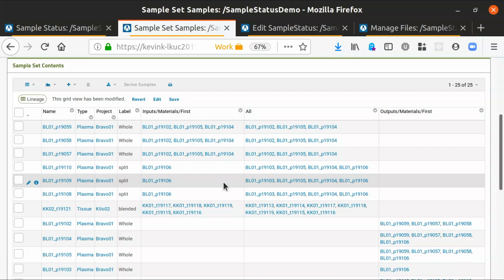So how does the sample manager interact with samples that are uploaded? Not generated in LabKey, but uploaded from the external sample manager and being kept in the specimen archive or specific study? Oh, specimen archives. Okay, so specimens are completely separate from sample sets. Yes, not to be confused with one another.